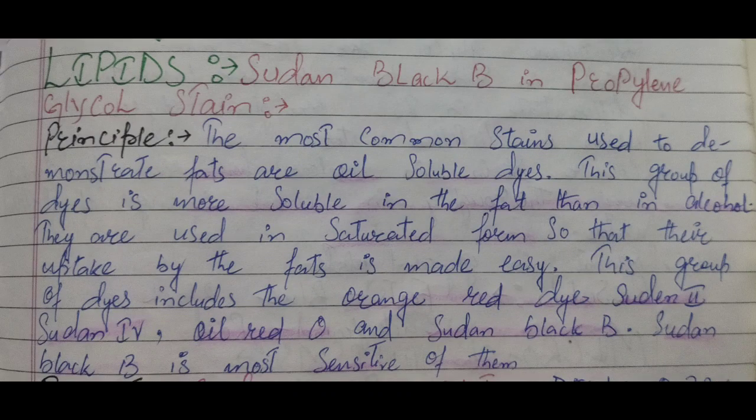आज हम डिस्कस करेंगे स्पेशल स्टेन्स की। और एक स्टेन जो हम लिपिड्स के लिए यूज़ करते हैं, सुदन ब्लैक बी इन प्रोपाइलिन ग्लाइकॉल स्टेन। प्रिंसिपल देखेंगे। The most common stain used to demonstrate fats are the fat soluble dyes.